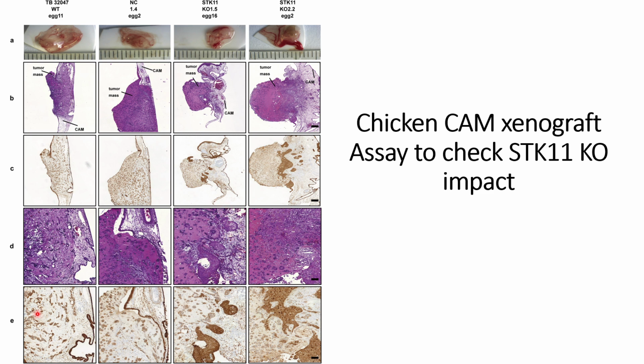And in the zoomed-in view of panel E, which is the zoom of panel C, here also we can see that in the case of both controls the cancerous epithelial markers are not too much compared to the knockouts, where the cancerous epithelial markers seem to be much higher.